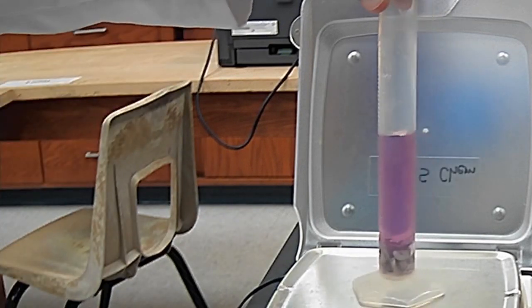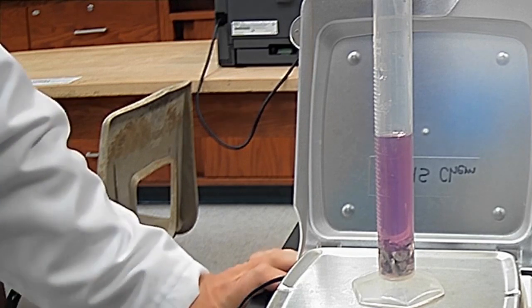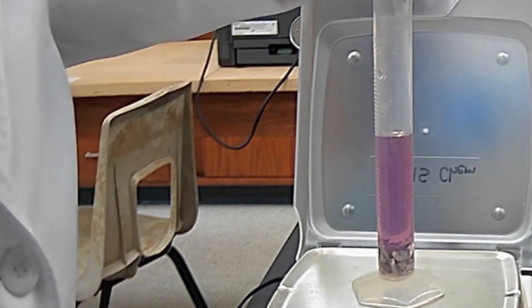Our new volume is, okay, here we go again, doing my exercises here. It looks like, I would say 16.9 milliliters. So our new one is 16.9 milliliters is the new volume with the metal for trial 3 metal A. So now you should have all of your data in there for metal A.